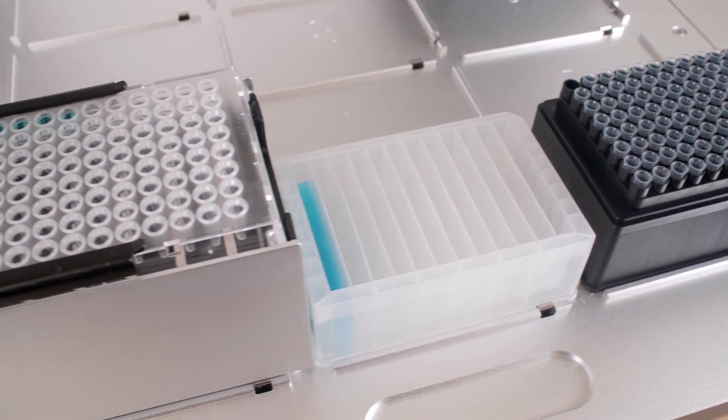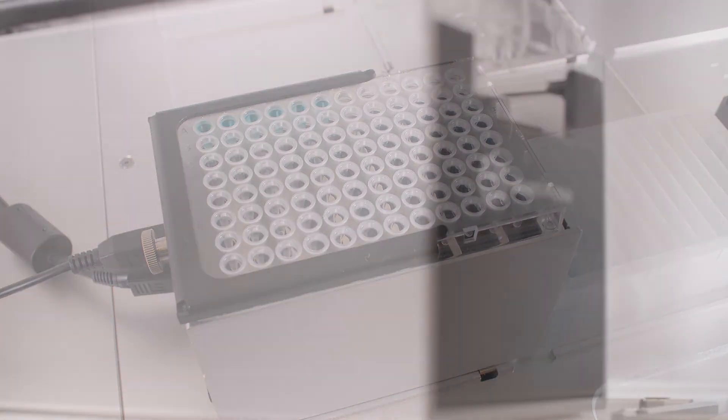Expand your lab's automation capability with the Opentrons magnetic module for only $2,400.